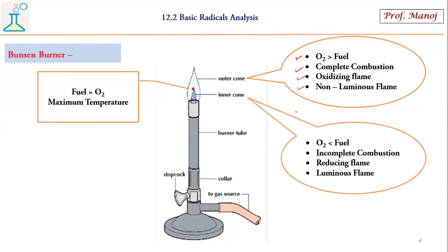While the inner core of the flame, what you see, all conditions are completely opposite. You can compare all the words written over here and see what I mean by that. So for examination purpose, you can remember this part, and this you can generate automatically.